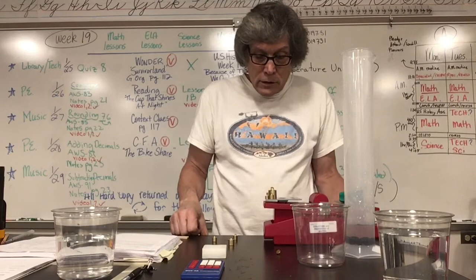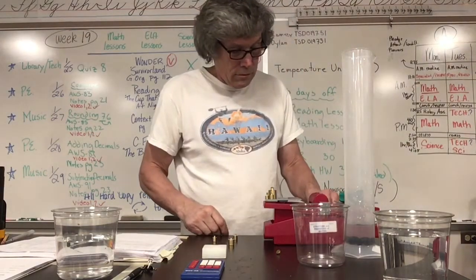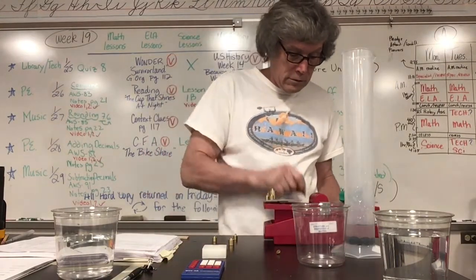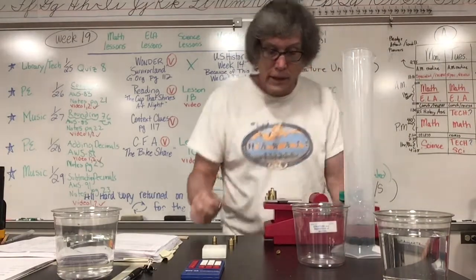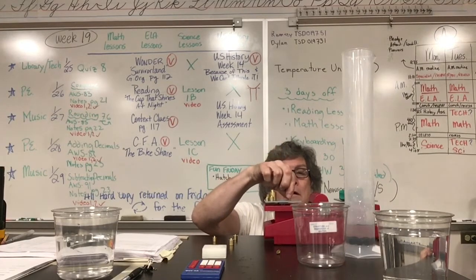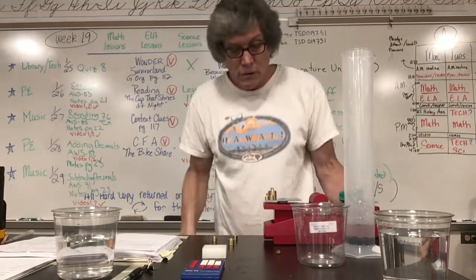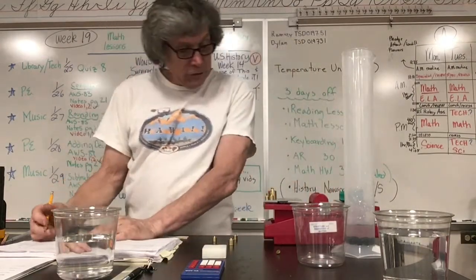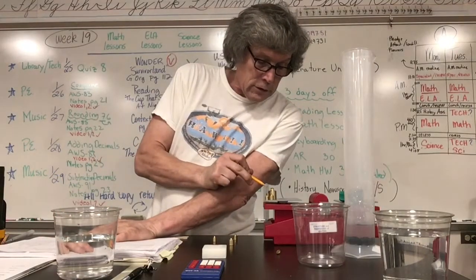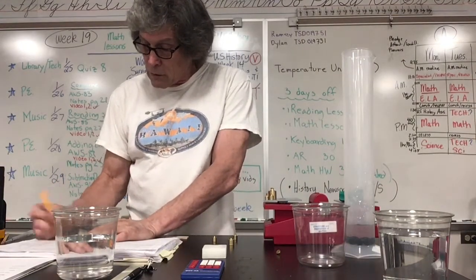Okay, 135. Too much again. Okay, let's try single 135. Actually, it's about 135. Oh, nice. So, for grams, 135 grams. Let me double check it. 120, 35. Yeah, 135 grams. So there's our data.